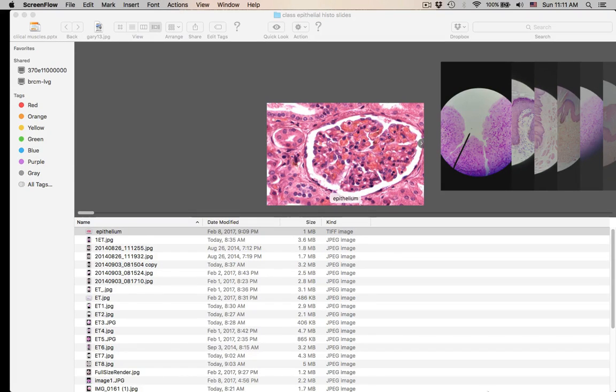Hi class, we're going to be doing a little quiz on epithelial tissue. Most, if not all, of these slides are from the classroom that students sent in.